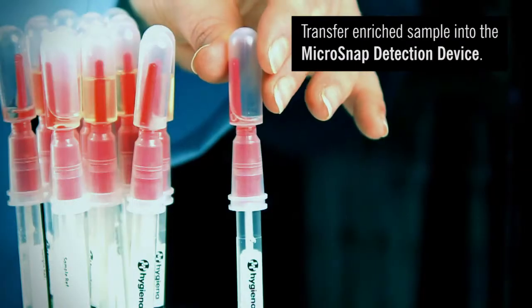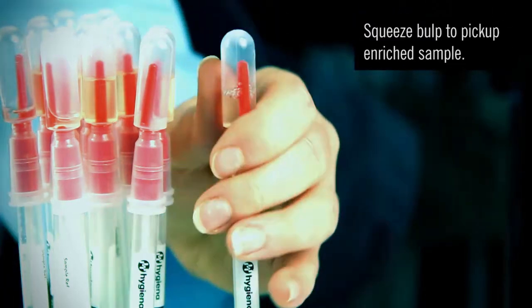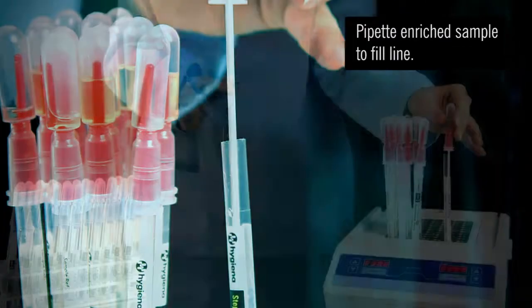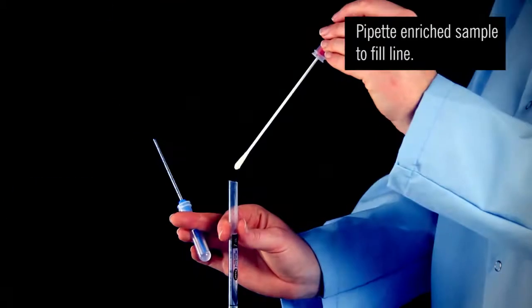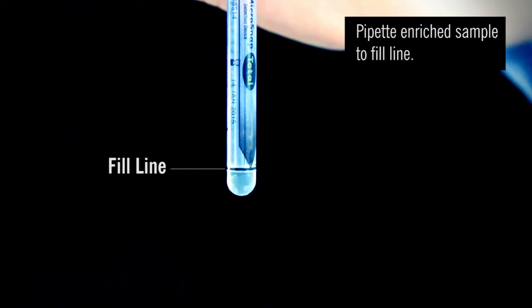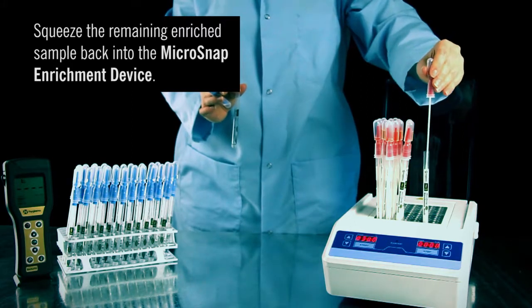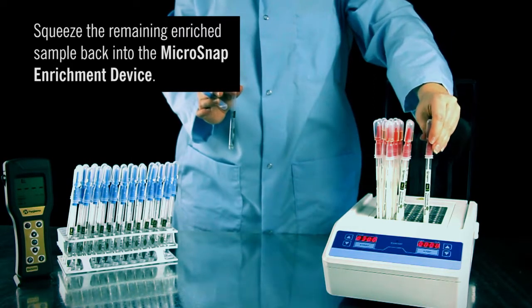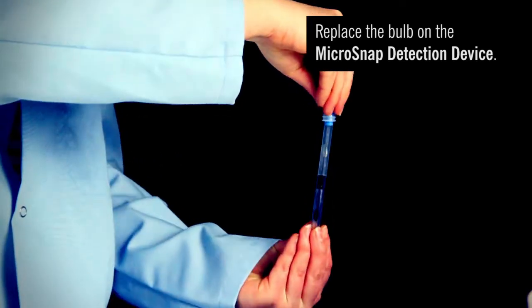Using the other hand, use the built-in pipette in the enrichment device to draw enriched sample into the bulb. Separate the enrichment swab from the tube and transfer the enriched sample to the detection device. The detection device has a fill line marked on the bottom of the tube. Fill to this line. The remaining enrichment sample may be returned to the incubator for additional testing. Replace the bulb on the detection device.